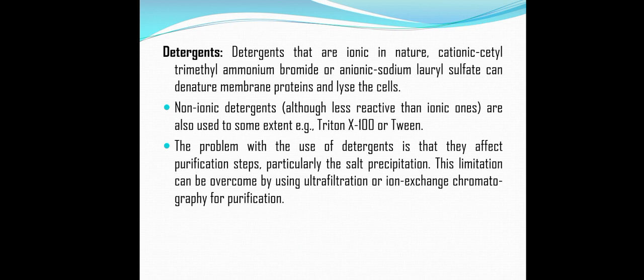The non-ionic detergents are less reactive than the ionic ones, and these can also be used to some extent, that is Triton X-100 or Tween 80. The problem with the use of detergents is that they affect the purification steps, particularly salt precipitation. This limitation can be overcome by using ultrafiltration or ion exchange chromatography for the purification process.